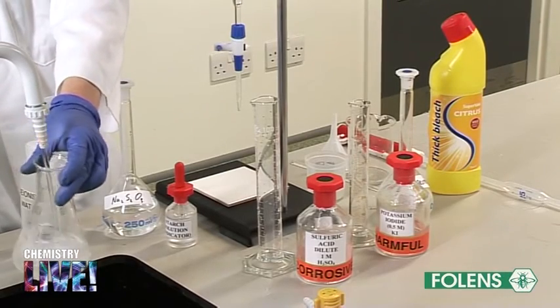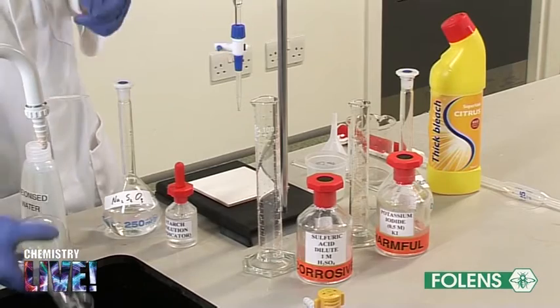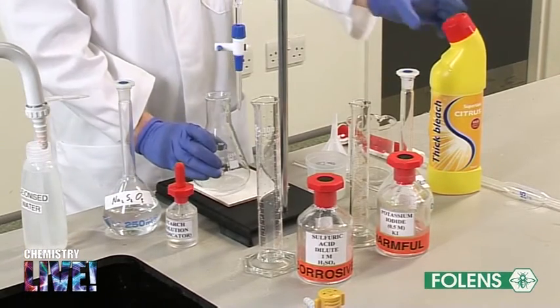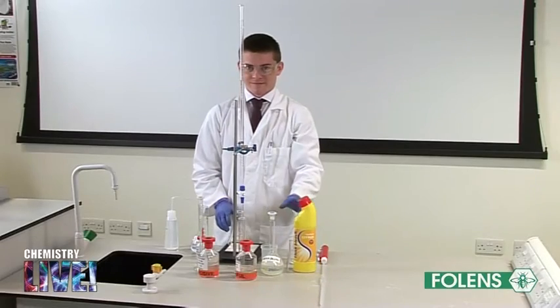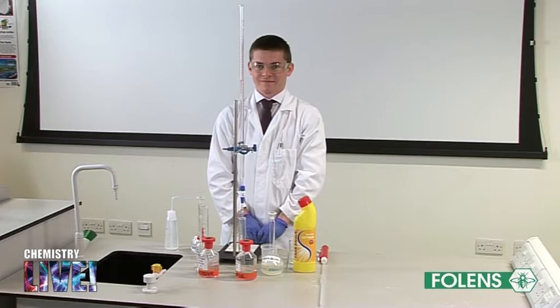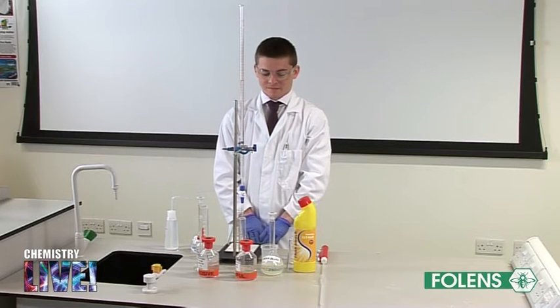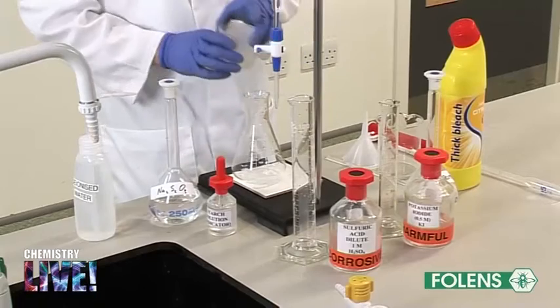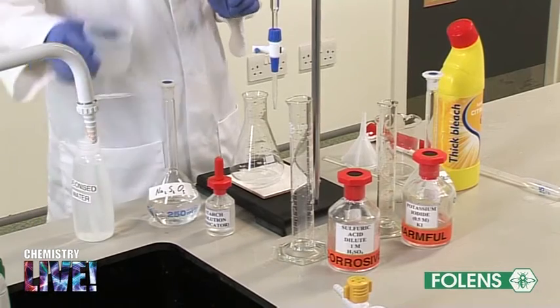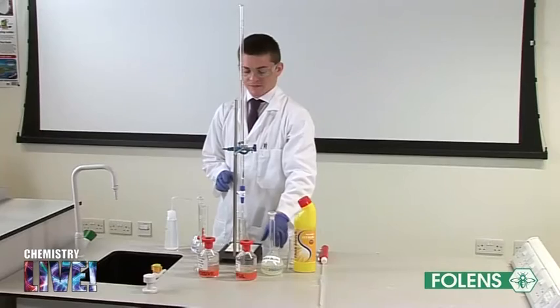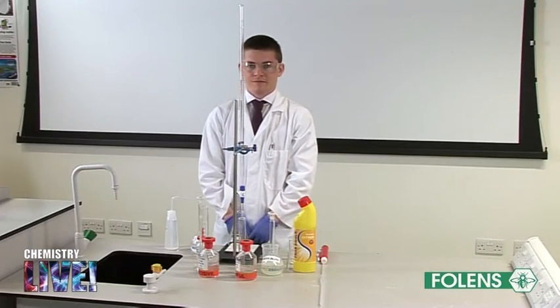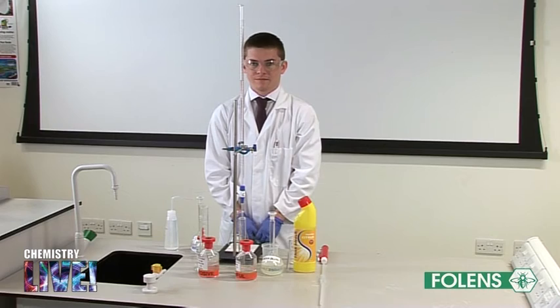The method of calculating the amount of sodium hypochlorite in the bleach is shown in your textbooks. Using the titration figures that you yourself have obtained, calculate the exact concentration of the sodium hypochlorite in the household bleach. The method of calculation is shown in your textbook. This concludes the experiment.